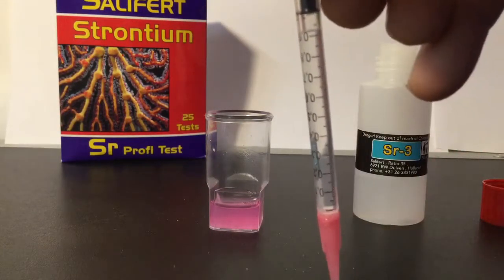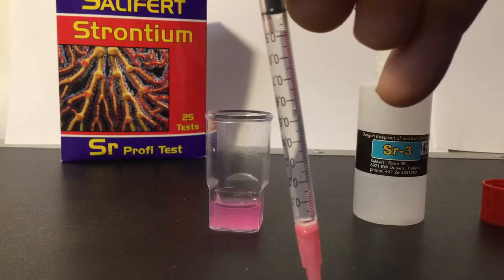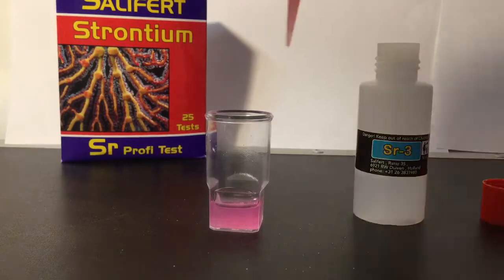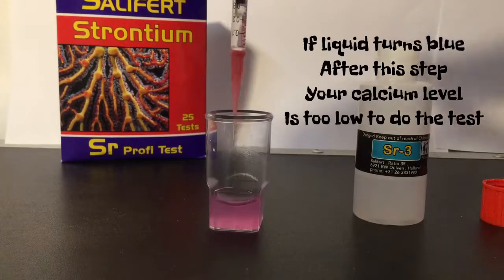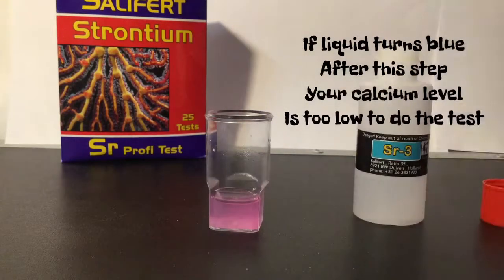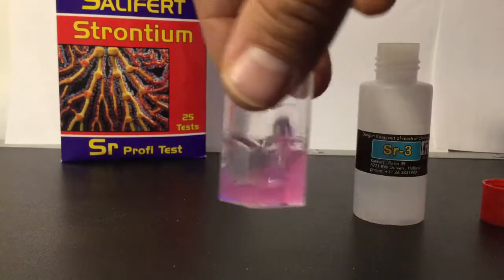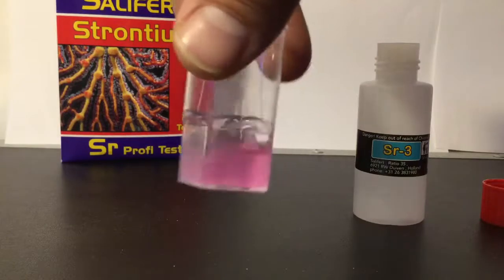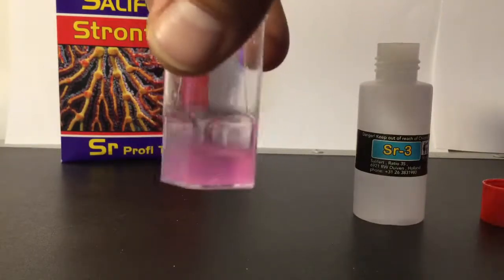The black bottom of the plunger has to be right at the one milliliter mark. Add that all to the test vial, just like that. Now we have to swirl it for 20 seconds.